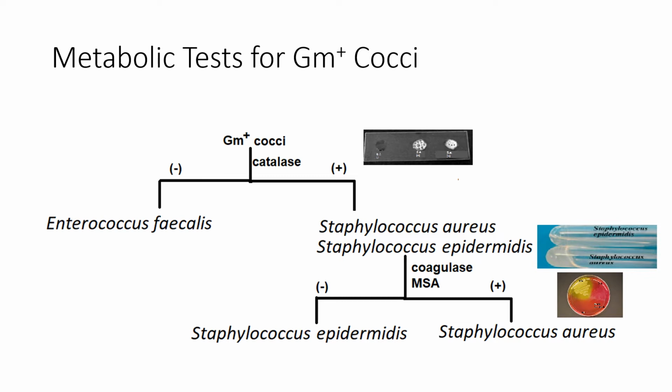What this is training for you, because eventually you're going to be looking at tests that were done on blood, tests that were done on sputum, tests that were done on stool, or what have you. And you've got to be able to say, I can conclude this. And people will try to press you. Does that mean this and this and this? And you're saying, you know what? I can't conclude that. The test only allows this conclusion.